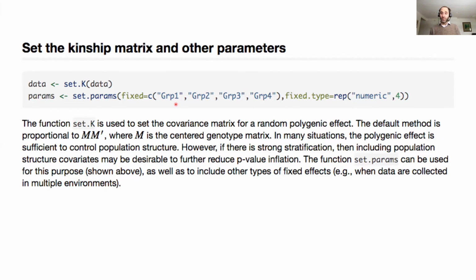And the last thing you can modify is whether you want to use what's known as the P3D approximation. Now, the P3D approximation means that the variances are only estimated once, and then it uses actually a generalized least squares test for all of the markers, which is faster, but it does have slightly less power. So if you want to disable that, you have to do that here.